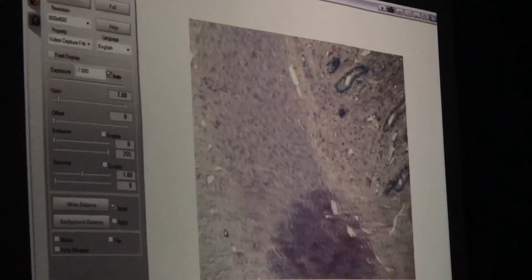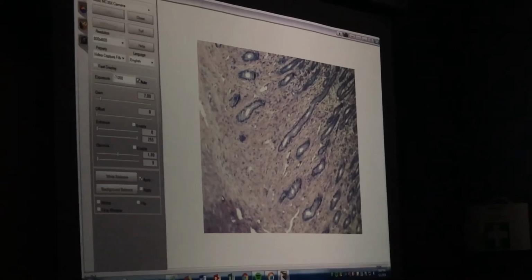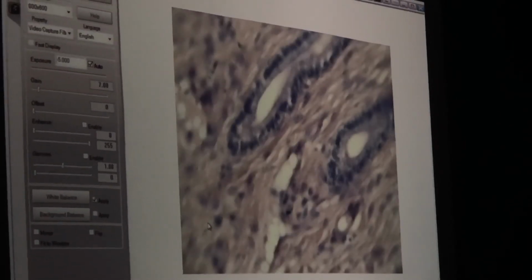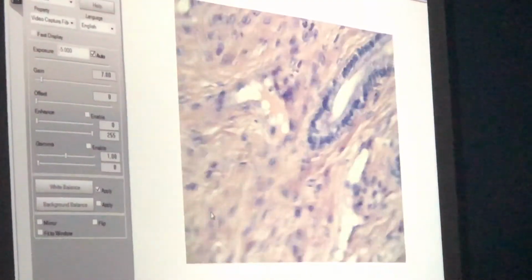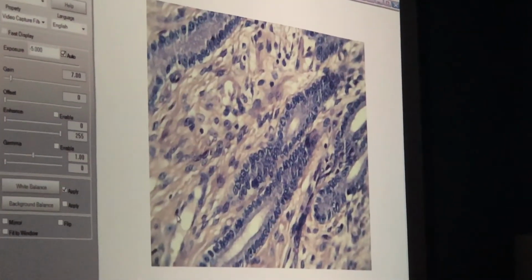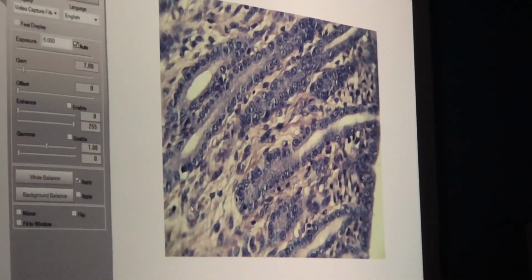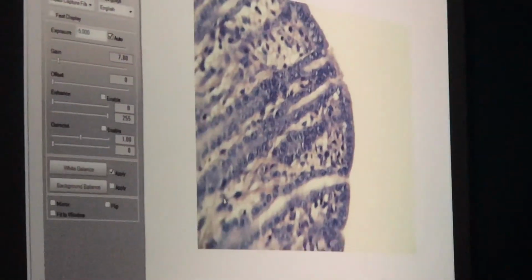I wanted to show you this because this looks kind of cool here. So when I was asking you what those structures were, look at it under high power. What kind of epithelium do you see there? Columnar. Yeah, it actually is more of a cuboidal epithelium, big round centrally located nuclei, which is what you find in the ducts of glands, and glands themselves.